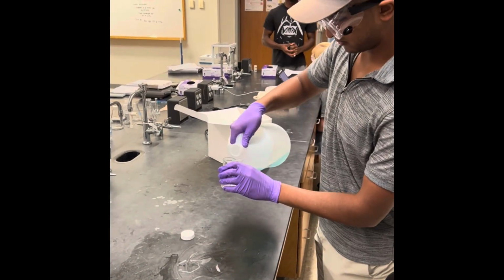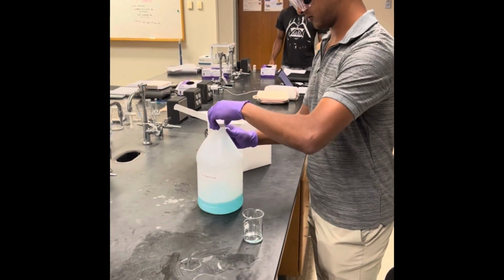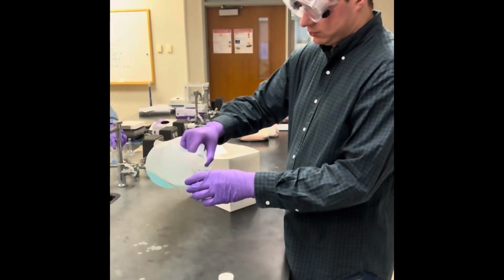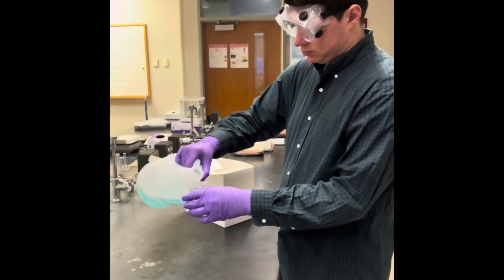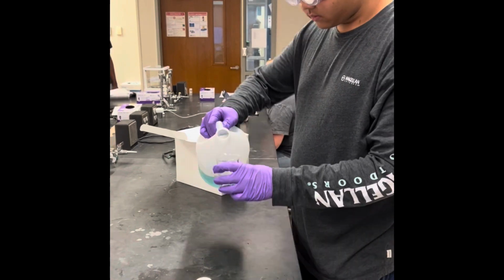After checking for proper attire, members can be seen transferring the stock solution into a beaker for the next step of blending the solution. Next, you can see each member grabbing a pipette and a bulb and carefully drawing the solution into the pipette, making sure not to get the solution into the bulb.